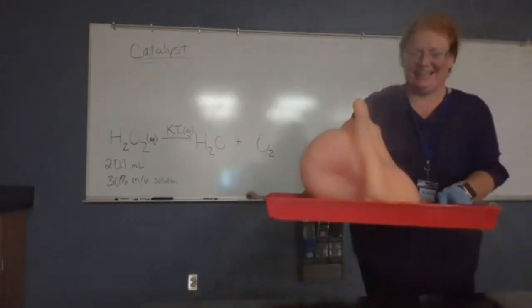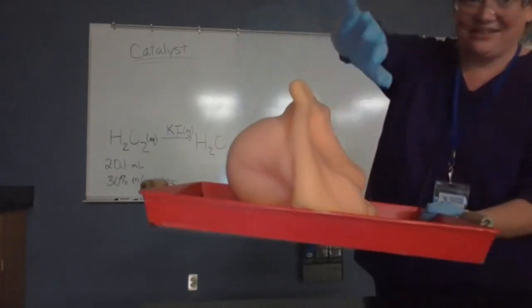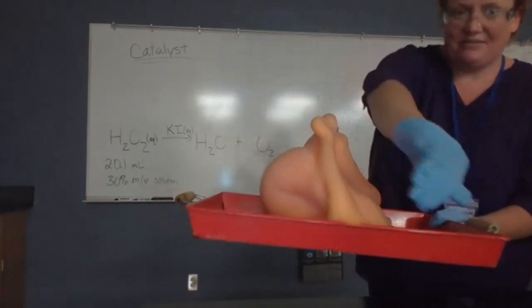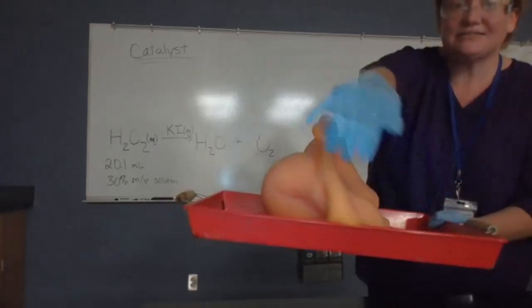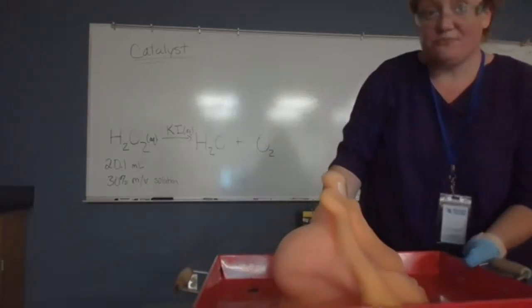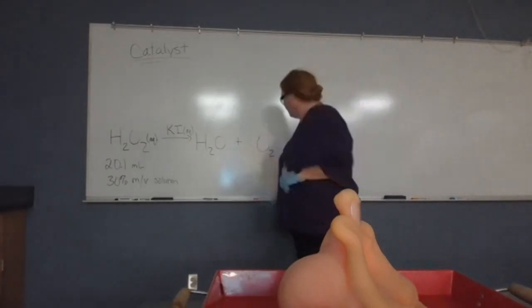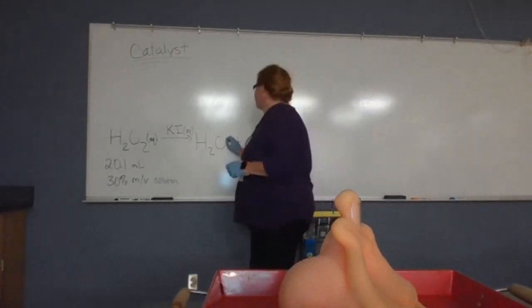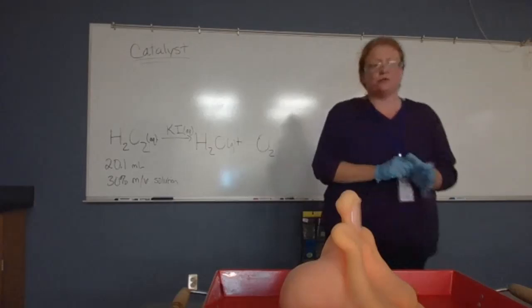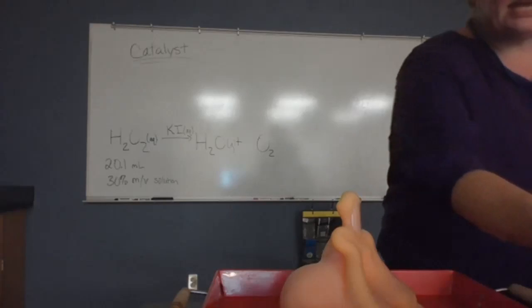Ooh, okay. Now, maybe you can see in the video, I don't know, there is steam coming off of this reaction. You probably can't see it. And there is heat coming off of this reaction. The steam is visible evidence that one of our products is indeed H2O. So this is H2O in the gas phase coming off of it. And the other product that I'm telling you made is O2, which is a gas, but we should be able to test for that by doing a splint test.